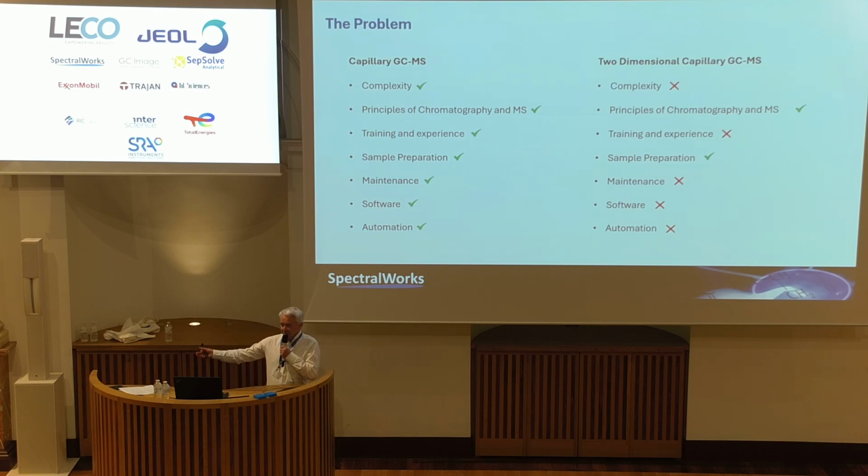There's a talk or a guided discussion this afternoon about trying to get people more trained and involved in 2D GC. What about training in statistics? Do we need it? Most people just use it. Sample prep, we know about it, it's the same thing. Maintenance, small changes can make big differences to your chromatography.